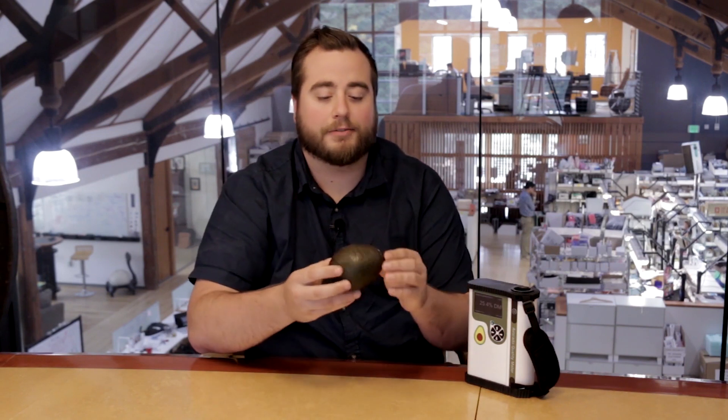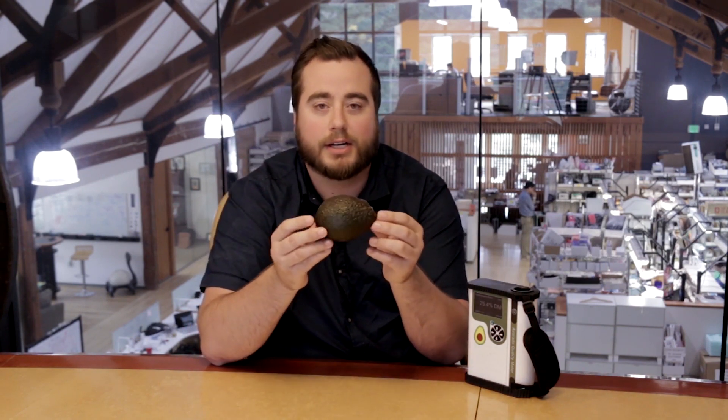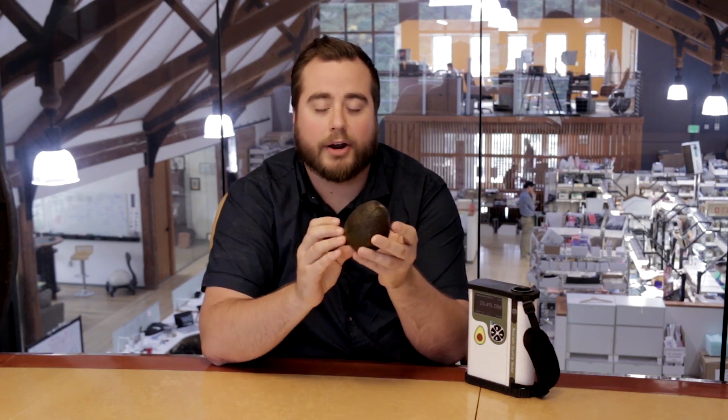Now before I get further into the instrument, I would like to explain where I scanned on the avocado. We scan at the largest part of the equator on the dorsal side, or the largest side near the stem, so that we get the lowest dry matter reading that we can. That's because this part of the fruit matures the slowest.